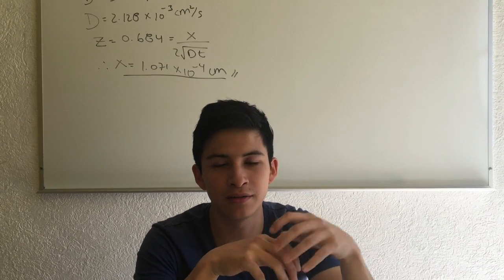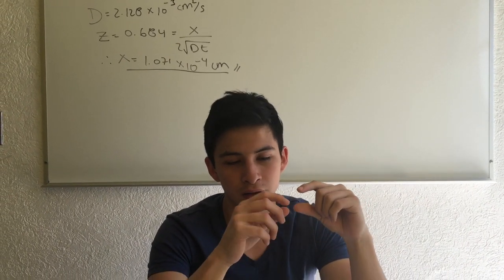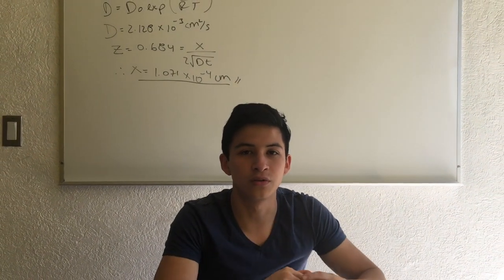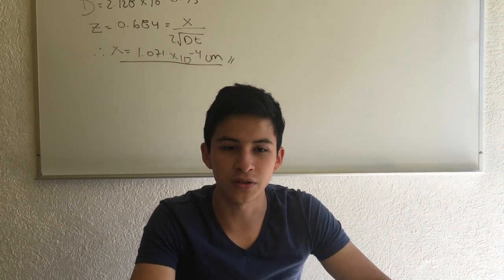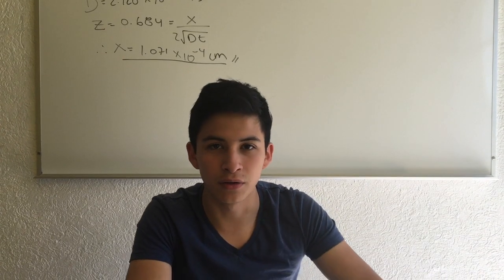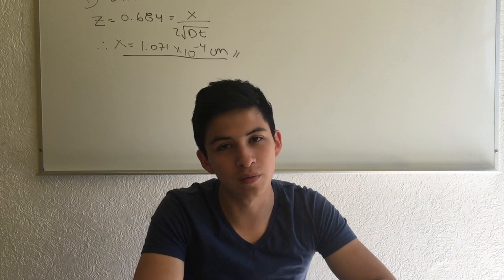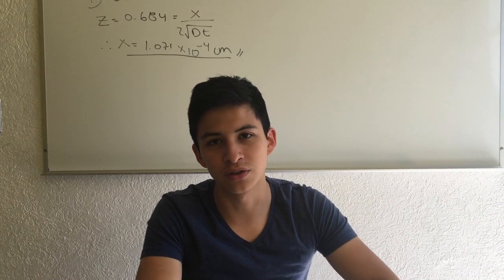The cemented layer is the portion of our steel that is now carburized and has the carbon that is absorbed. Quench is when you rapidly cool your piece in water or oil to obtain some properties. Temper is heating the metal below the critical point for some time and then cooling it in air. And diffusion is the net movement of molecules or atoms from a high concentration to a low concentration area.